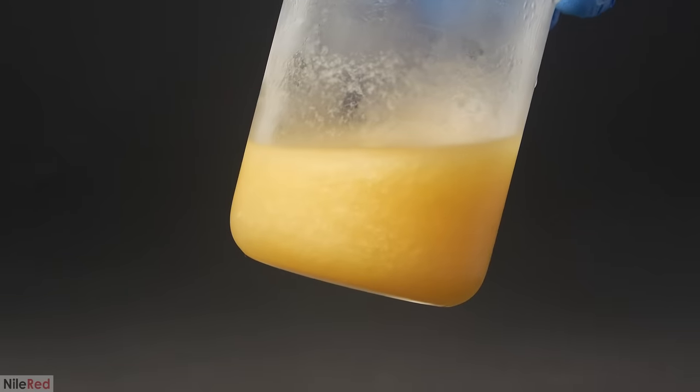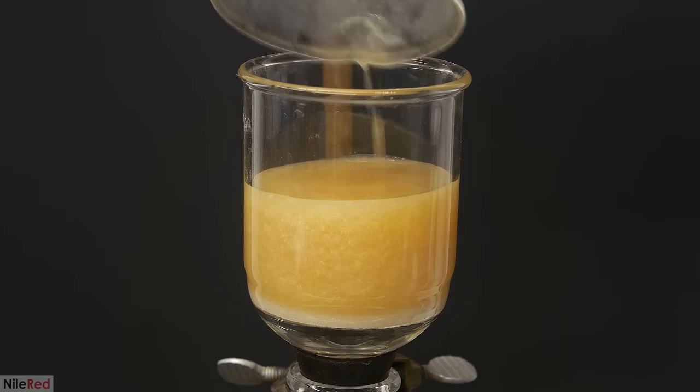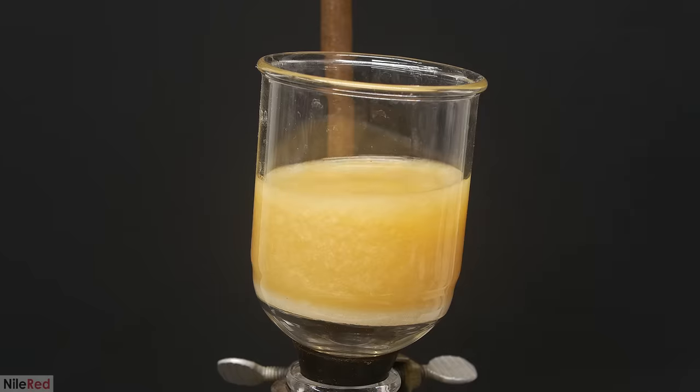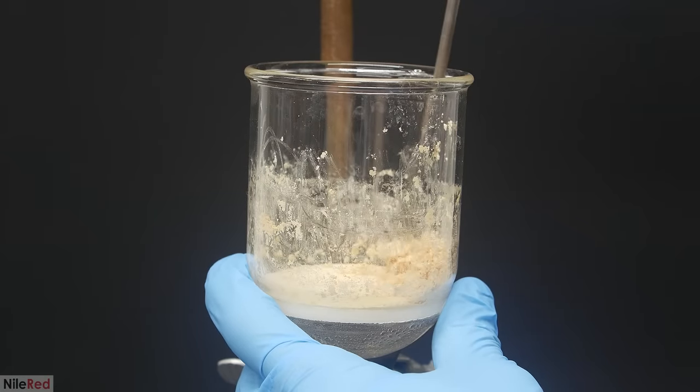Then I put the whole mixture in the freezer for a couple hours. To separate off the phenytoin, I added it to my vacuum filter and pulled away the liquid. I washed it with some ice cold water to get rid of any acid that remained, and then I transferred it to a beaker.